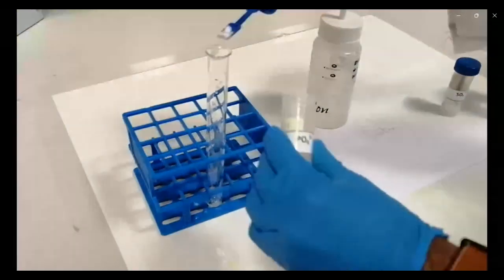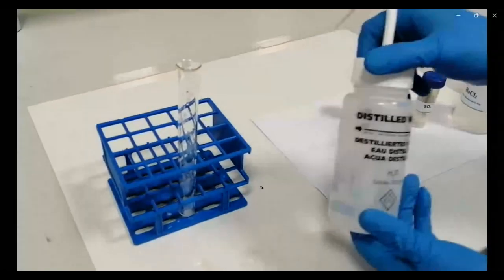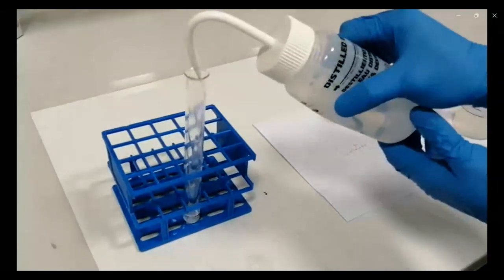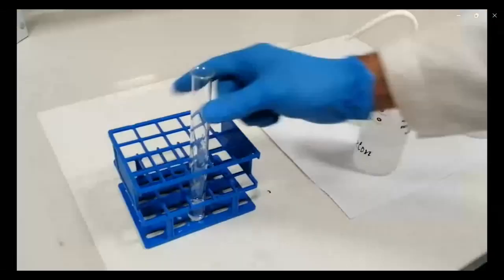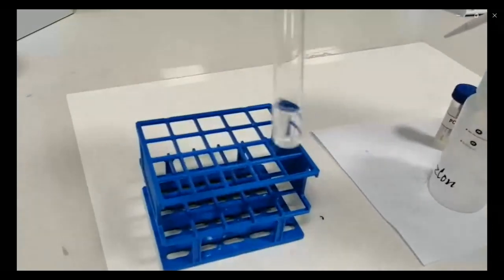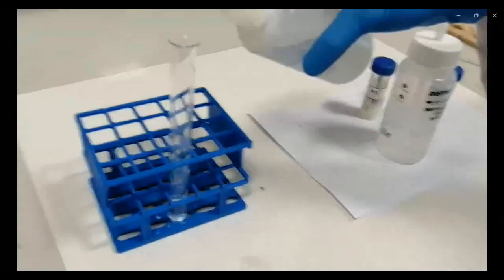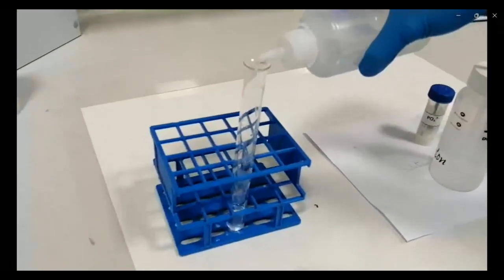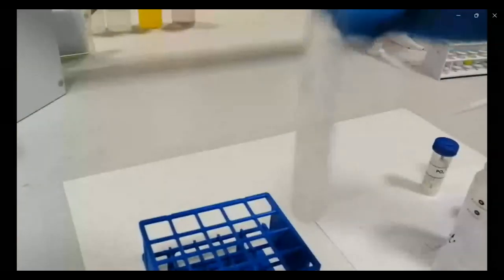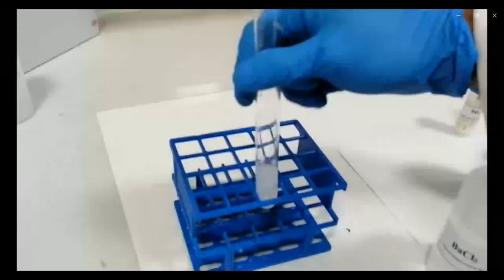In case of phosphate, also prepare a solution and then add barium chloride, and you will see a white precipitate. But actually this precipitate will dissolve in nitric acid. Let us see that. Solution plus barium chloride, also a white precipitate. You have to mix them very well.